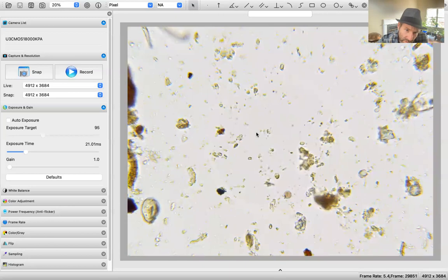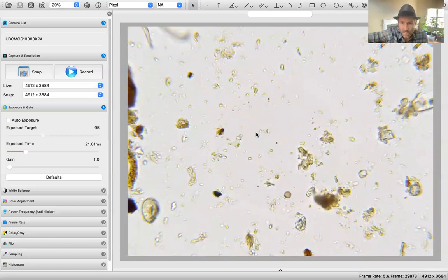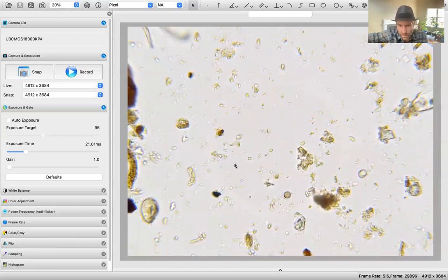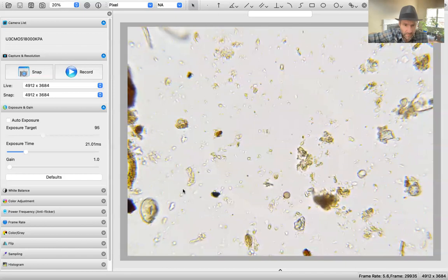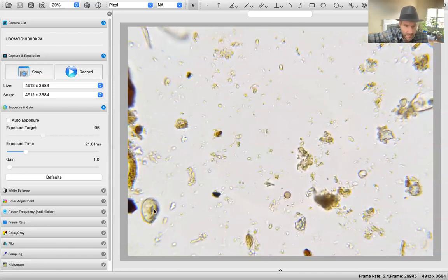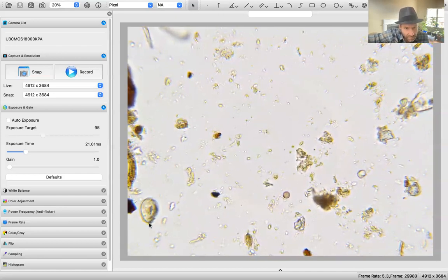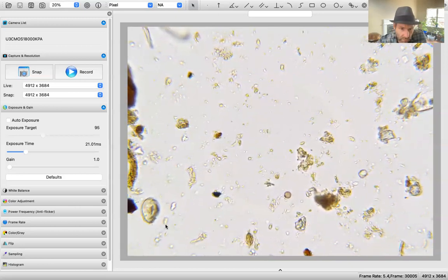That looks like maybe a spore in the bottom left. No flagellates, and just double checking real quick before I get off track. Don't see any flagellates zooming around. No, but this possibly might be a type of spore. I'm not real sure. I don't see a flat spot where it could be an opening. And I don't see where I can clearly make out an organism inside.